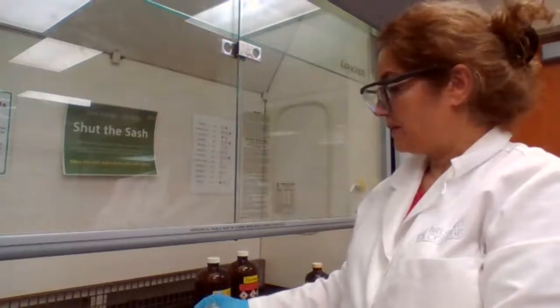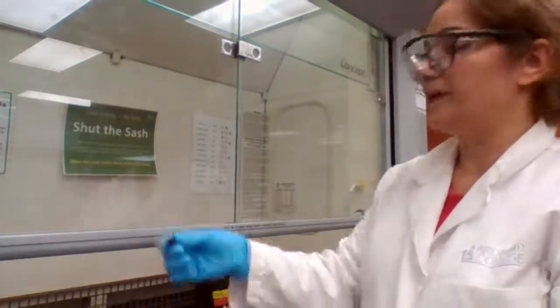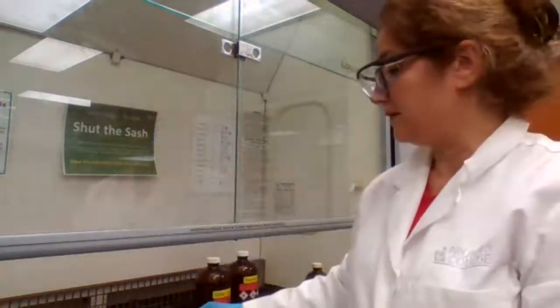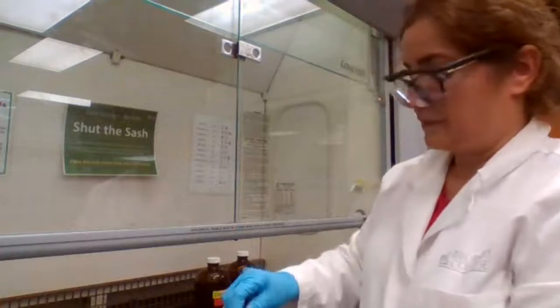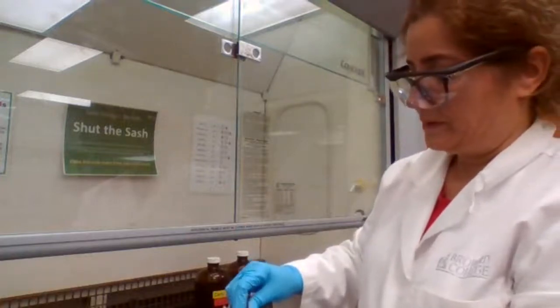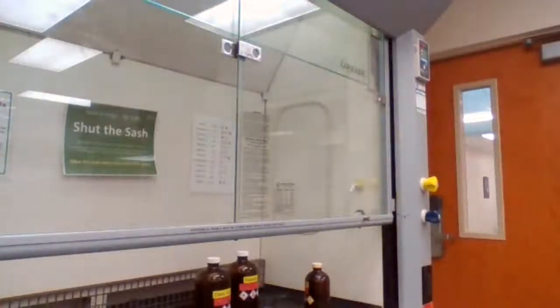B, okay. I have a problem: my dropper is contaminated. So I'm going to have to change the dropper because I'm afraid that it's not going to give me the right result.